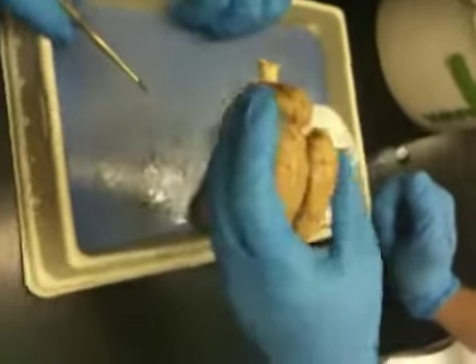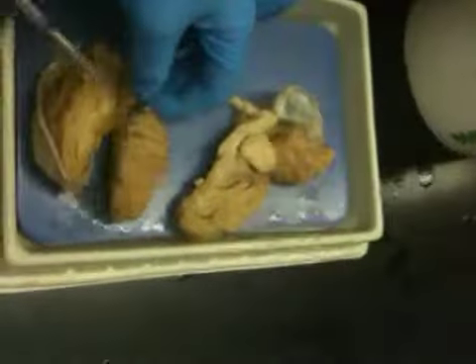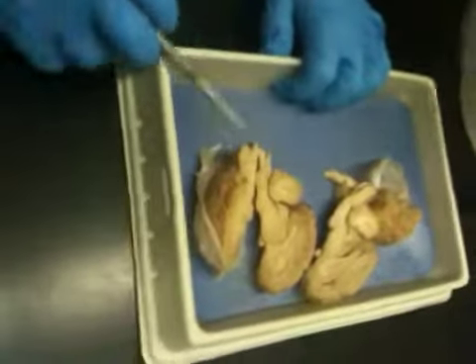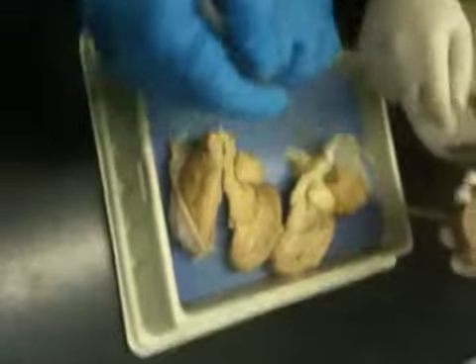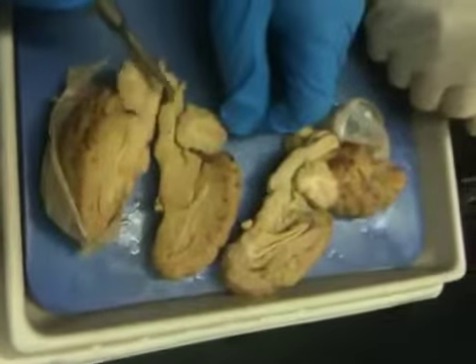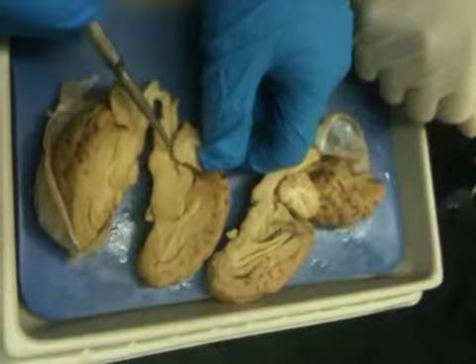And were we right about the tectum, rostral, caudal colliculi? That it was actually in here? Yeah, it's right in here. Okay. And then all that's left is the medulla oblongata. Oh, here. The medulla oblongata is this here. This changes into the spinal cord. The fourth ventricle is right here.